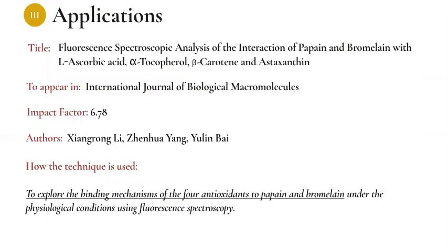Now, I will discuss the applications. Fluorescence spectroscopy is a rapid, sensitive method for characterizing molecular environments and events. For this reason, fluorometry is widely used in the field of research compared to other analytical techniques.